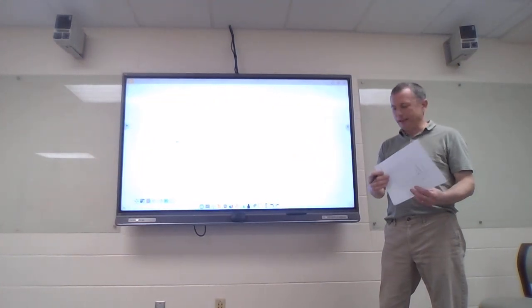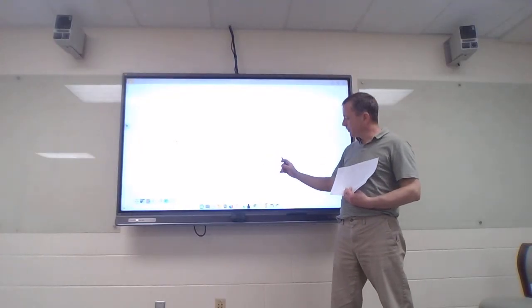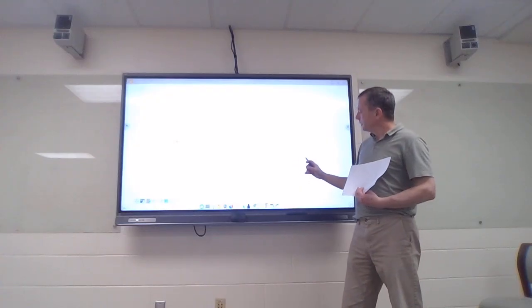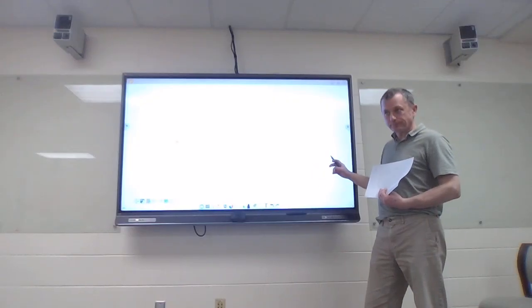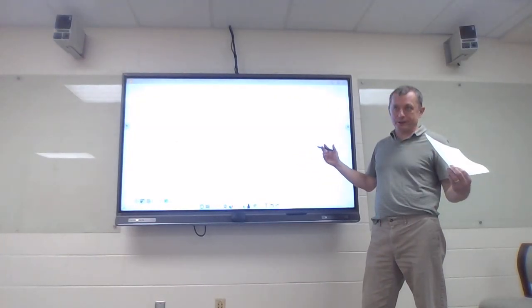So if you notice there on 8, again I'm seeing 6 split into a doublet. There's 1 H here, still up around 1-ish. I've got a sharp singlet around 2 next to a carbonyl. I've only got 1 oxygen this time, not 2.